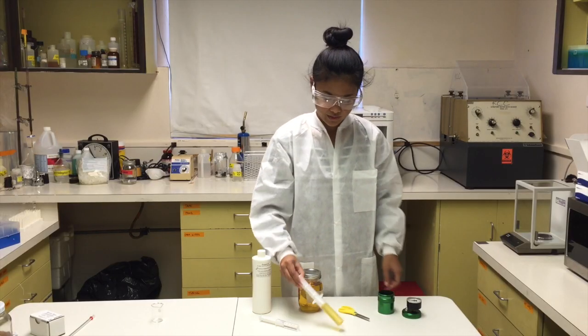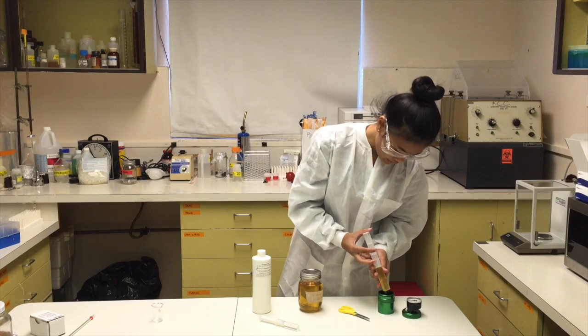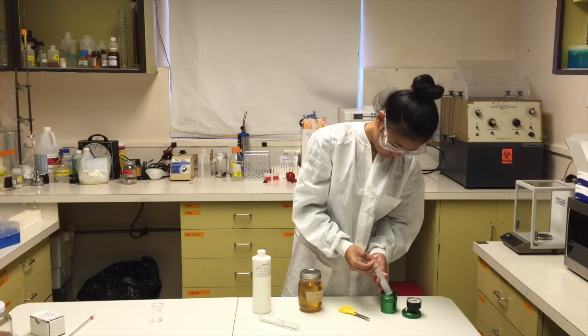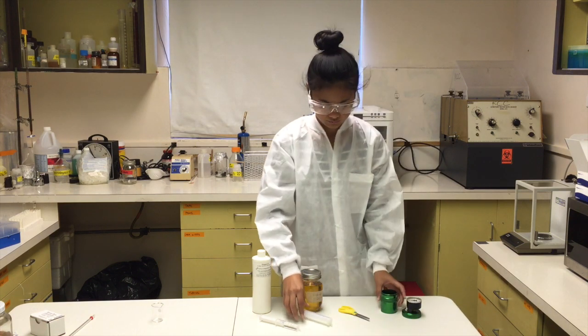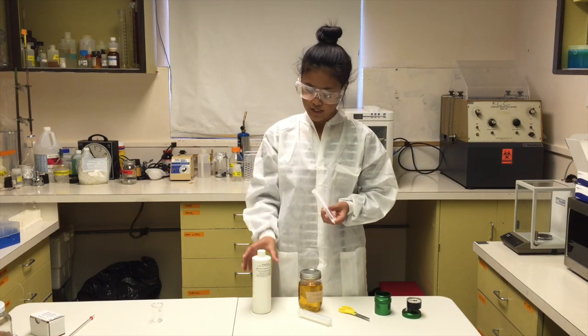Now we're going to take 30 ml of the biodiesel and put it in the large chamber. And now we're going to put in 10 ml of reagent B.